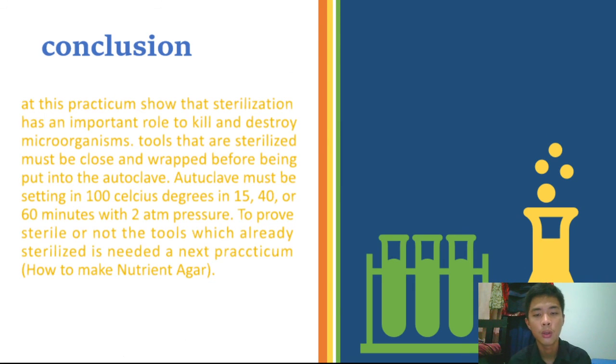This practicum shows that sterilization has an important role to kill and destroy microorganisms. Tools that are sterilized must be closed and wrapped before being put into the autoclave.